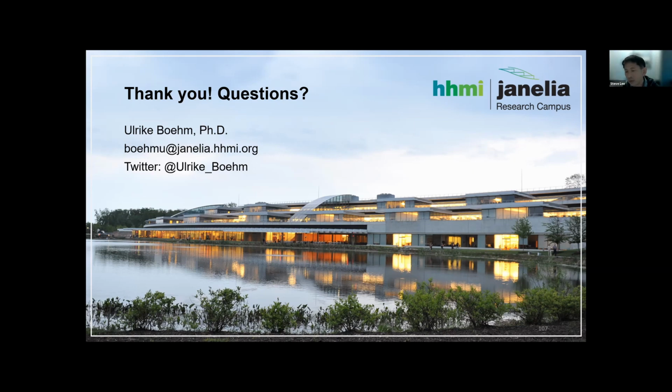Yeah, and that's something which, for example, the group at Yale, led by Joerg Bewersdorf, I think they've implemented this in their 4Pi single molecule switching microscope. But that then again requires another thing: you need to have a very good precision. You need to make sure when you drop the stage that you can merge these different layers nicely together again. Yep, sure. Any questions? Anyone else?